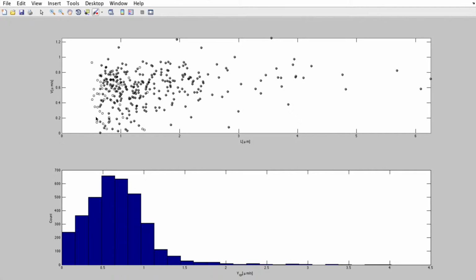So what we need to do is to find a value of velocity that will act as a threshold between the active and the arrested population here. And looking at this graph, I would say a good point to cut would be here. So let's pick 0.2, or maybe to be a little bit more accurate, a little bit higher, 0.225.